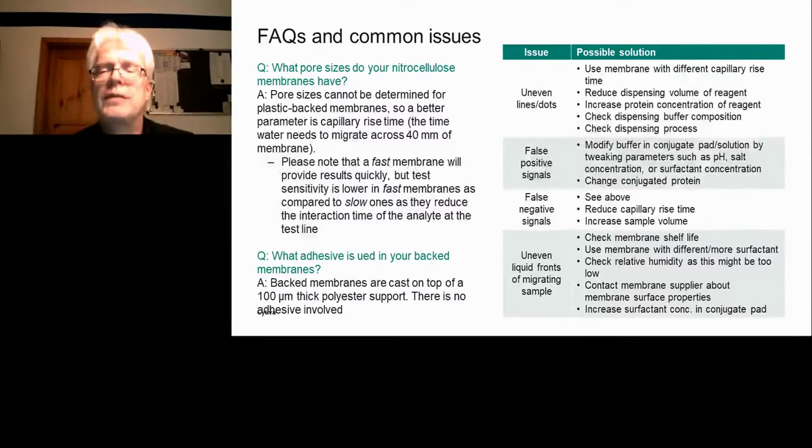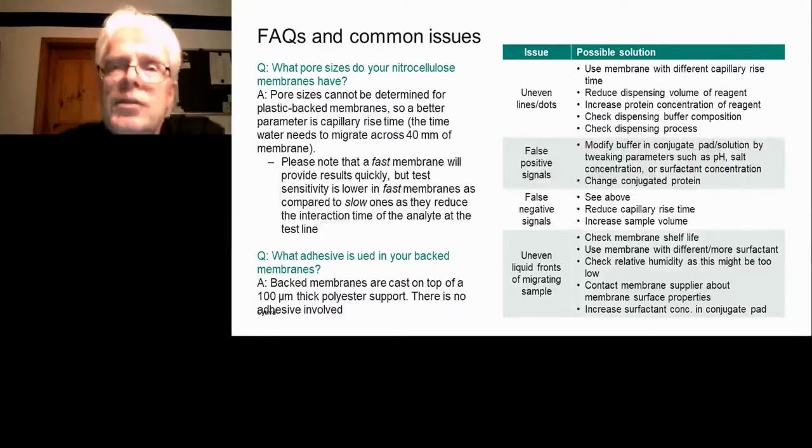The question with the hydrophobicity of membranes is a very interesting one. Hydrophobic membranes, or let's say membranes that have a low surfactant content, they're not really hydrophobic, can easily give you better sensitivities because they have a less negative impact on your binders, especially on the test line.